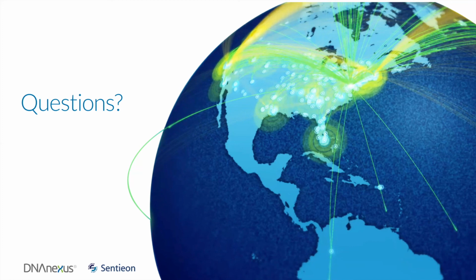That is possible with the Sentieon tools. Our tools do scale to 100,000 samples simultaneously. The difficulty is that 100,000 samples is many. If you're talking about whole genome sequences, 100,000 whole genome GVCF files is many terabytes of data. I think that might come up to about 500 terabytes of data. So it's difficult to have a backend to process all that data simultaneously. But yes, the Sentieon tools do scale to extremely large joint call sets.